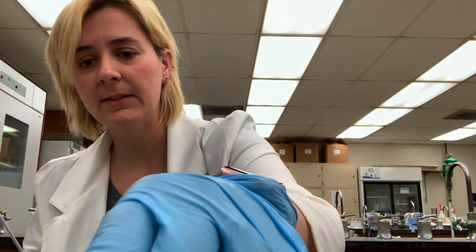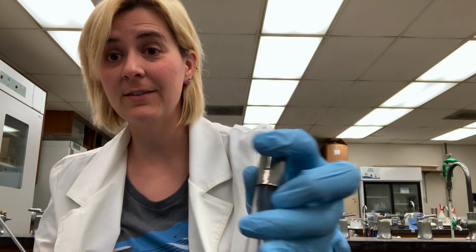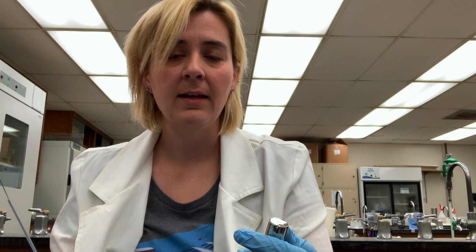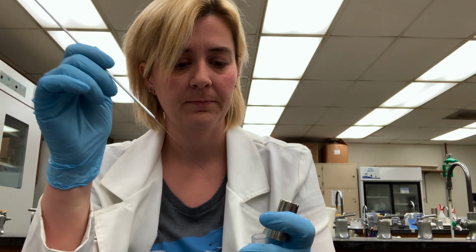And then finally, I have a mixed culture that should contain some Gram positive, some Gram negative. And so I would hope that if my staining technique is accurate, I will be able to see the Gram positive cells as purple and the Gram negative cells as pink in one field of view.